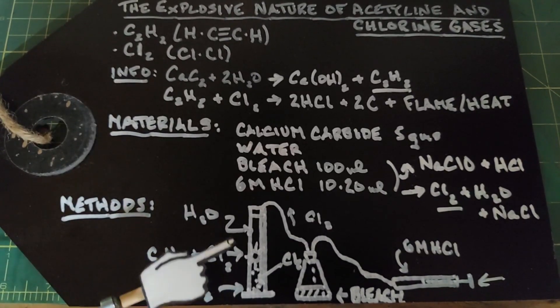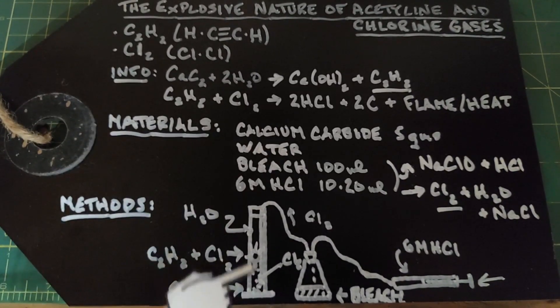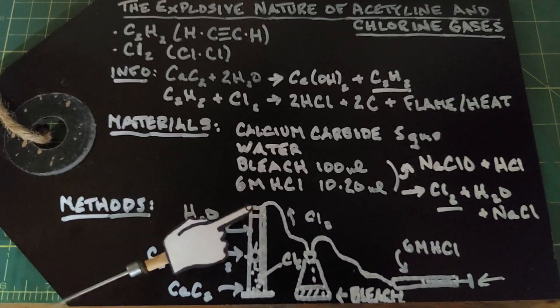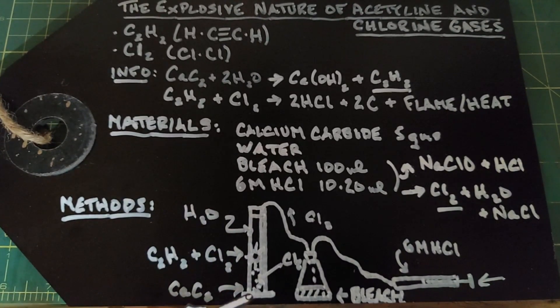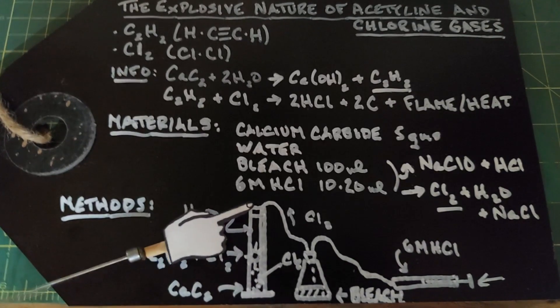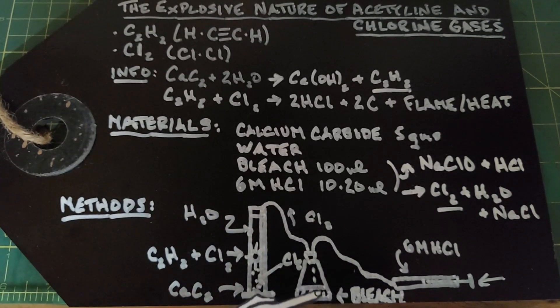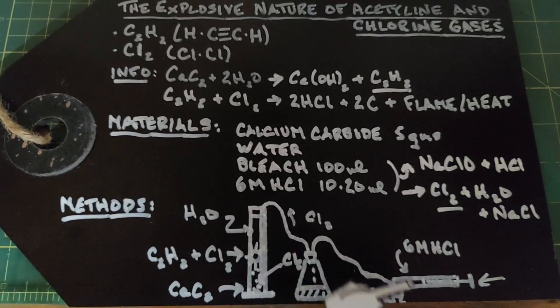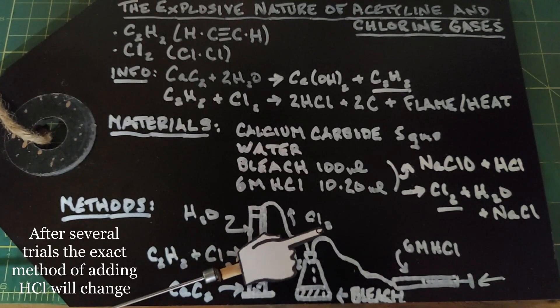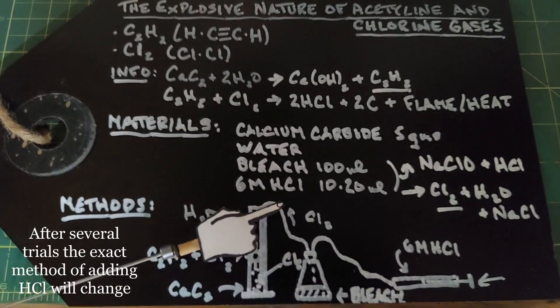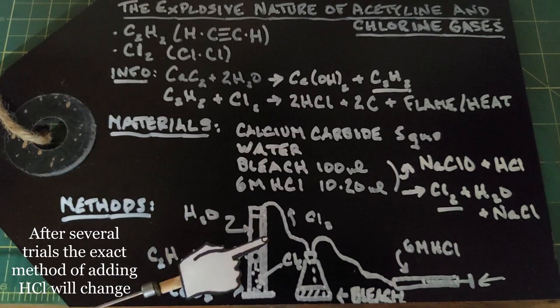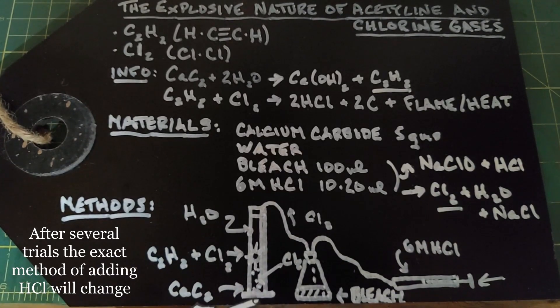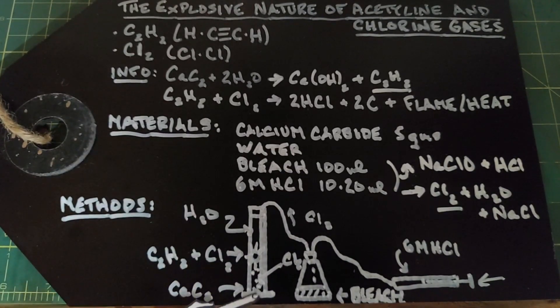Here's the setup: I have a clear tube made of polycarbonate, two feet tall and about three inches in diameter, glued down with silicone to the top of another container. We're going to fill that completely with water. Over here we have a flask with our bleach in it — it's going to be corked. When we push in our six molar hydrochloric acid, chlorine gas will be formed and follow a tube down into the middle of the column. At the bottom will also be our calcium carbide.